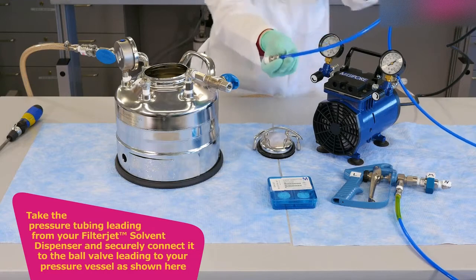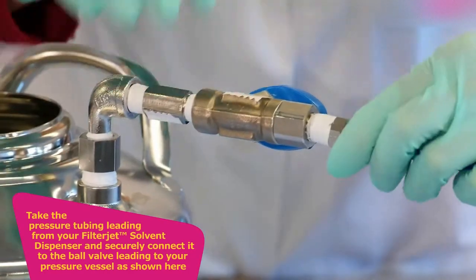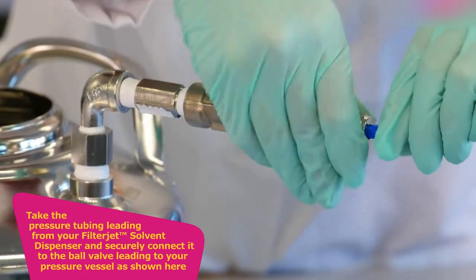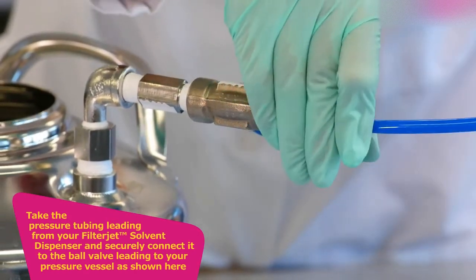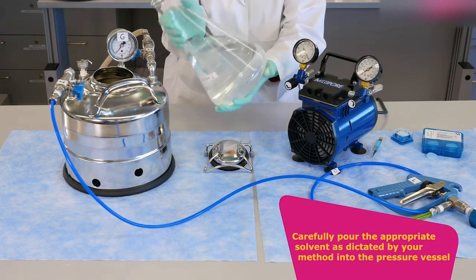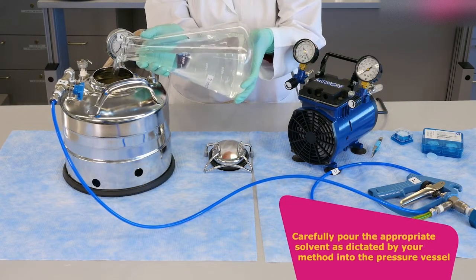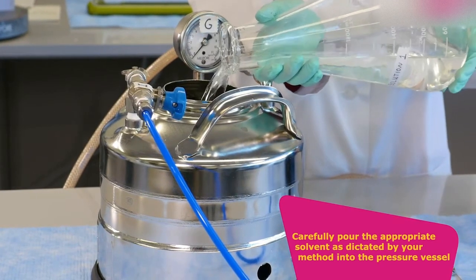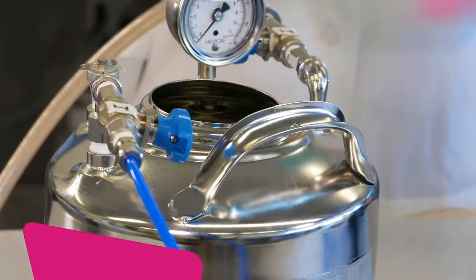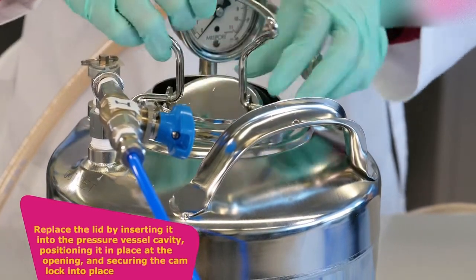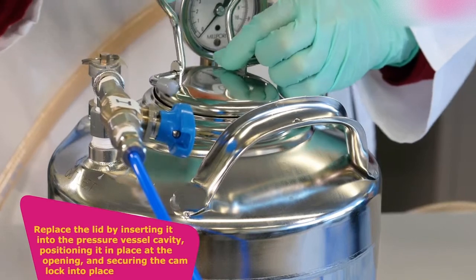Take the pressure tubing leading from your filter jet solvent dispenser and securely connect it to the ball valve leading to your pressure vessel as shown here. Carefully pour the appropriate solvent as dictated by your method into the pressure vessel. Replace the lid by inserting it into the pressure vessel cavity, positioning it in place at the opening and securing the cam lock into place.